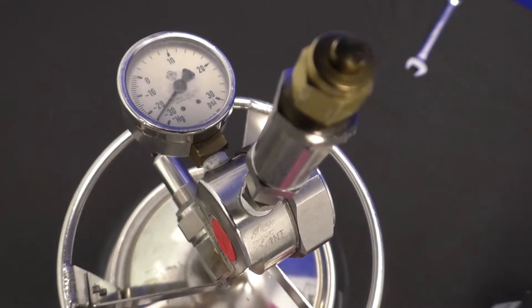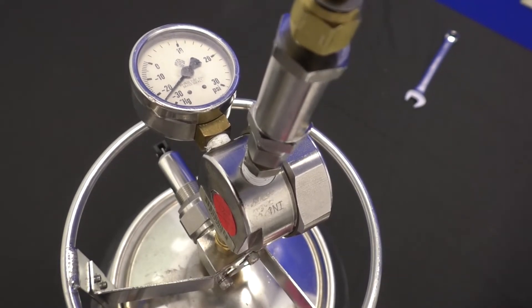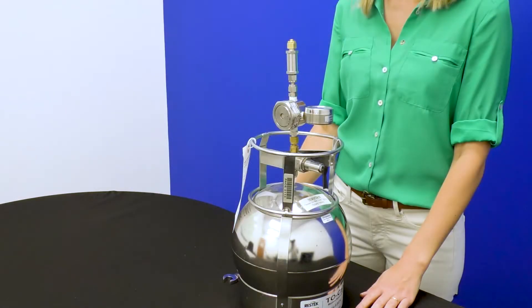If the pressure drops, this could indicate a loose connection at the canister, at the brass nut, or within the flow controller, which may impact your sampling event.